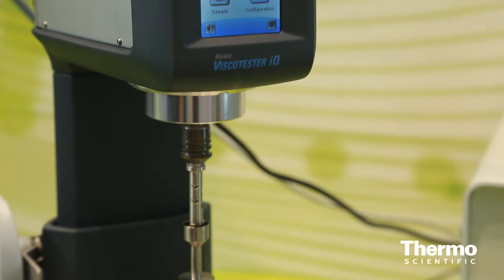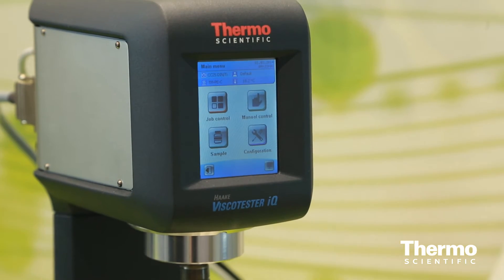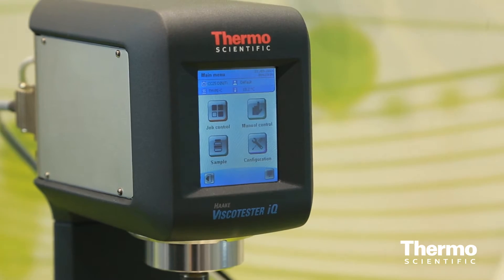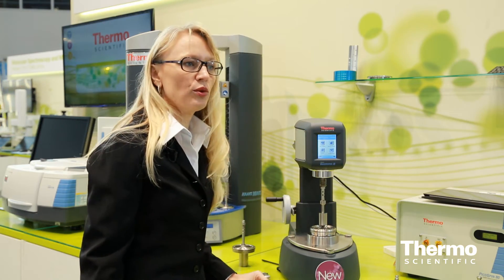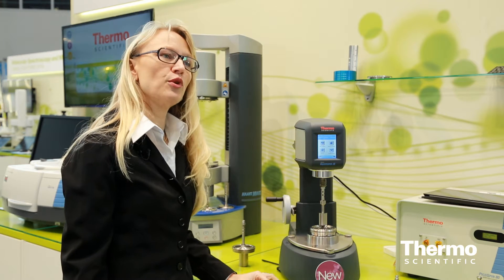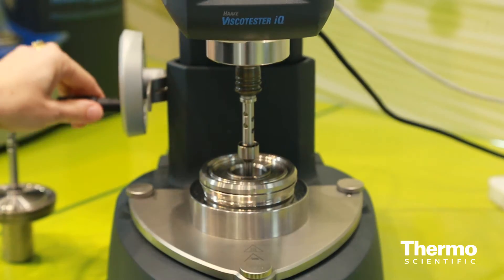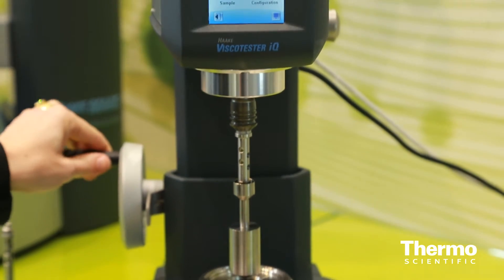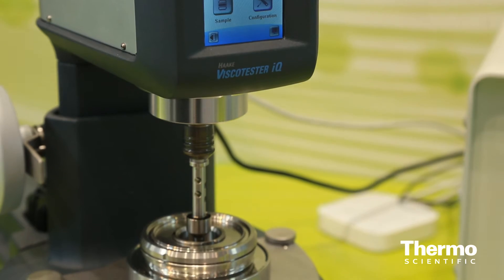The measuring head has a highly dynamic, powerful motor which enables measurements in controlled rate and also in controlled stress mode. We have a multilingual multi-line display which provides information not only numerically but also graphically. We have a breakthrough concept for the lift with this wheel to go to an upper position and also down to an accurate measuring position.